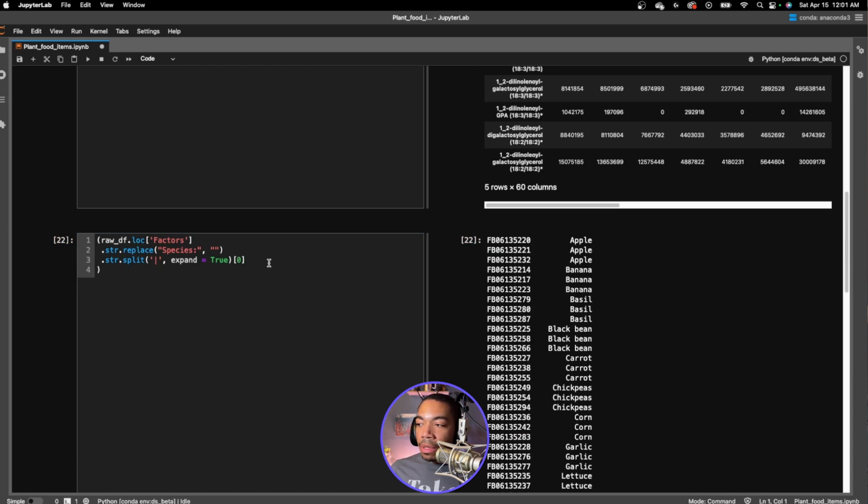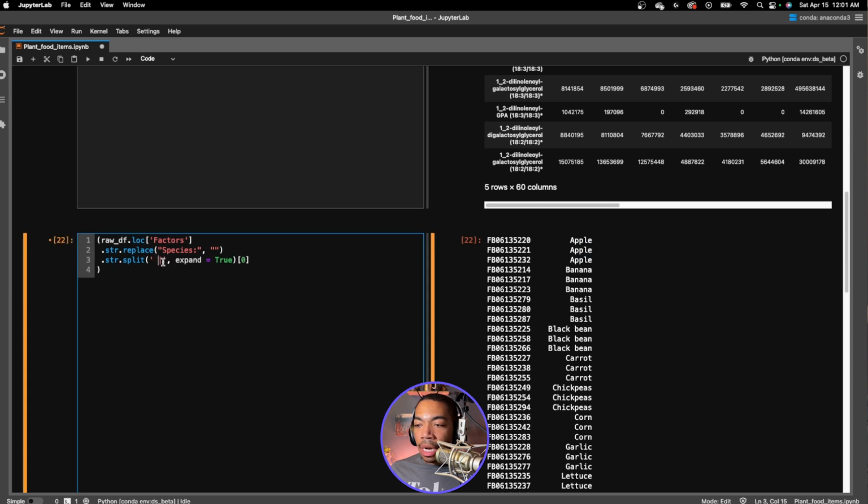Now, this is maybe a deceptive view because what happens here is that it appears that there could be white space after this apple. And that's because I think around this bar there was a space on either side. But in case, I want to show you how we can get rid of that. Well, let me show you how we can determine if it's present.